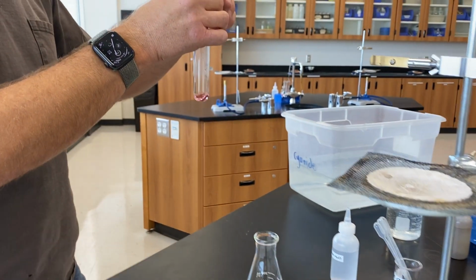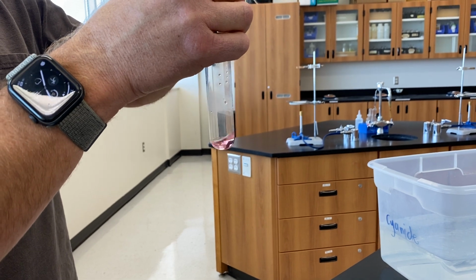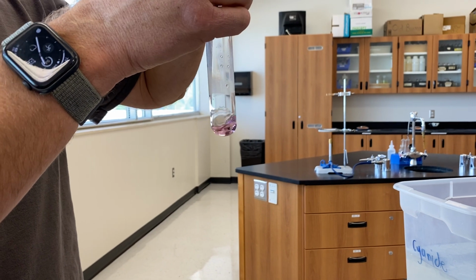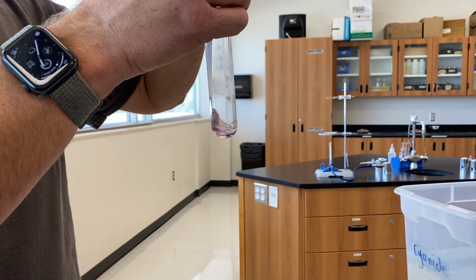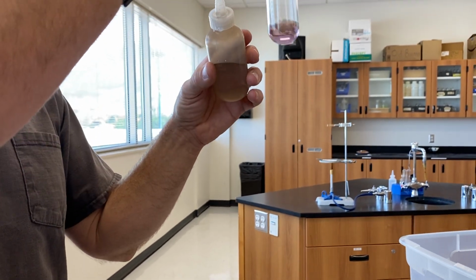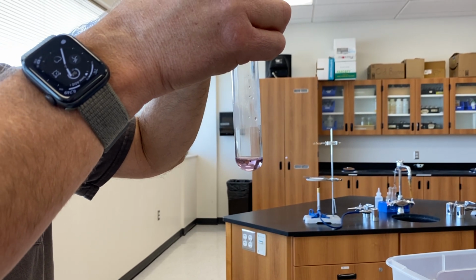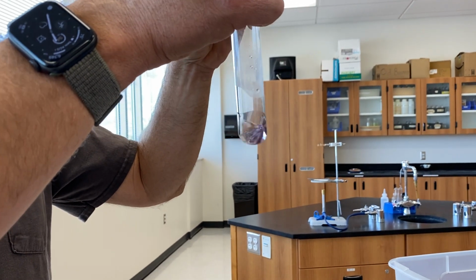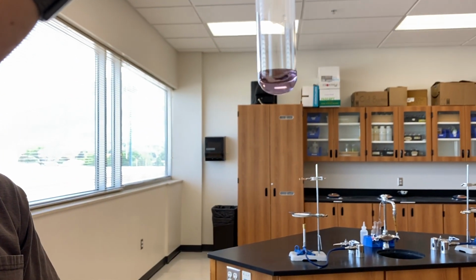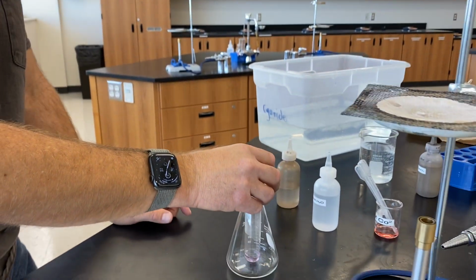Now in step 6, we're going to add more hydrochloric acid back to this, but we're going to simply do that until we achieve a purple color, which is understood to be halfway between blue and pink, meaning that we have approximately equal concentrations of reactant and product ion. Does that read purple to you? Yeah, that's the purple color. All right, there's our purple color. So we just finished step 6.